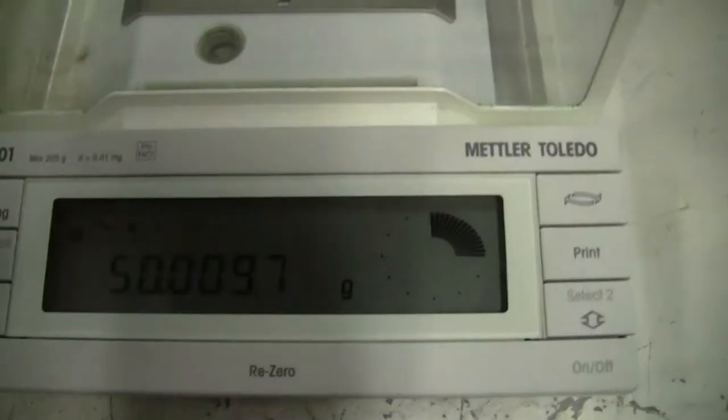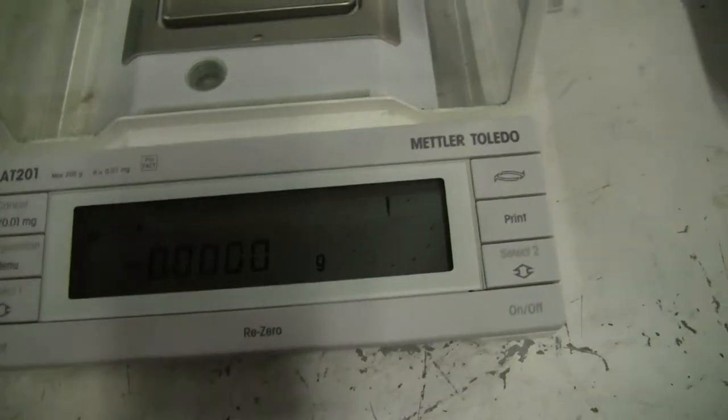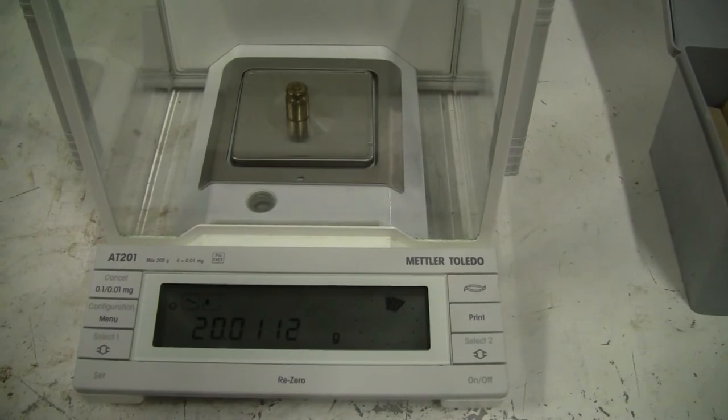Take a look at a different weight. Let's zero back out again. Put a 20 on there. There's your 20 gram.